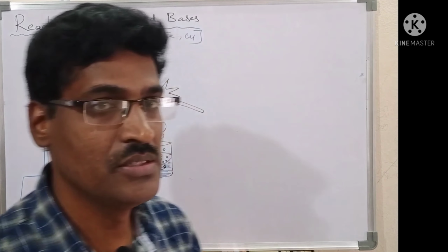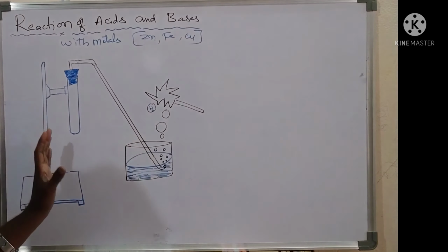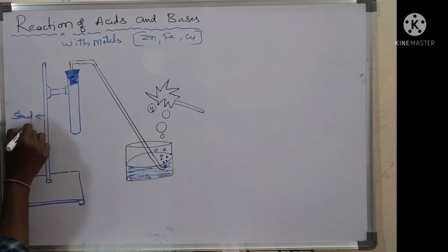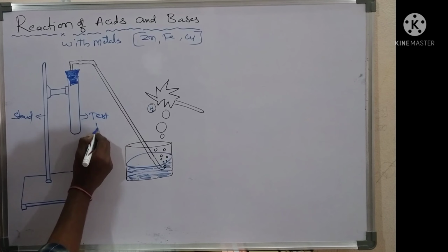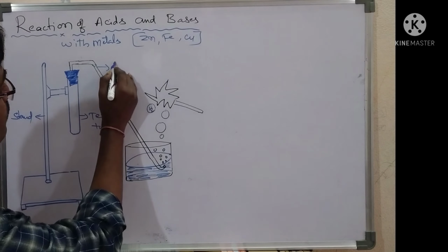Let us see. Here you are seeing on the board the stand, test tube, and delivery tube.